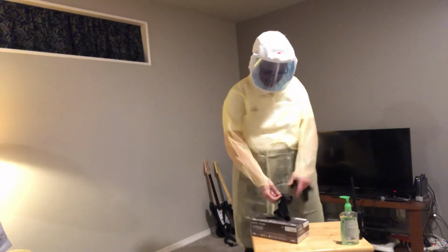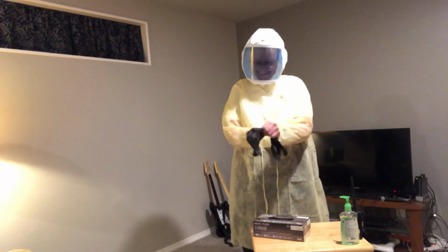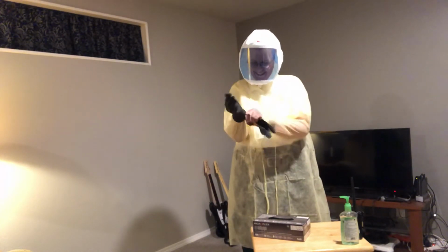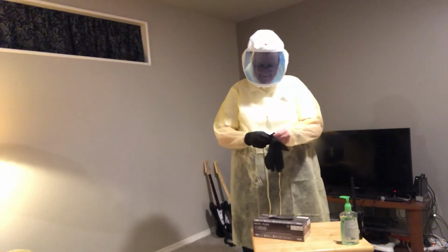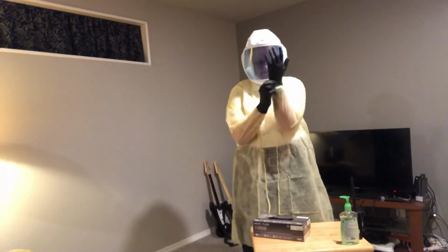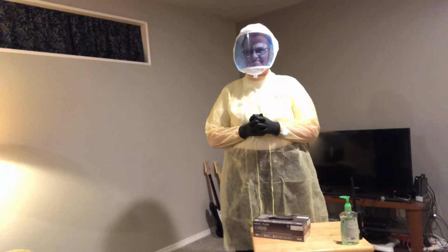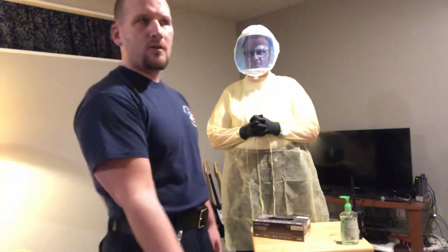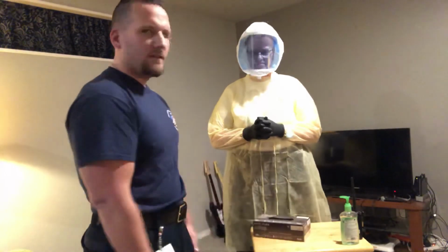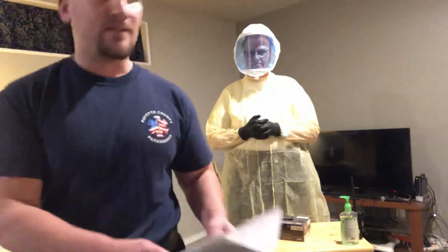So now gloves. She's gonna obviously glove up. These gowns and me don't get along today, do they? If you guys saw the last video, you know my struggle with gowns. All right. So notice how she's putting the gloves on over top, using the thumb hole. She's not bringing the gown over top of the gloves like I've seen some people do. Just don't. As everyone knows and has abundantly mocked me for by this time, I have transported now 7 COVID positive patients confirmed, and I am proof that PPE works. So I know the little things may seem tedious and silly, but they work. It's not worth taking the chance. So anyway, gloves over the gown.